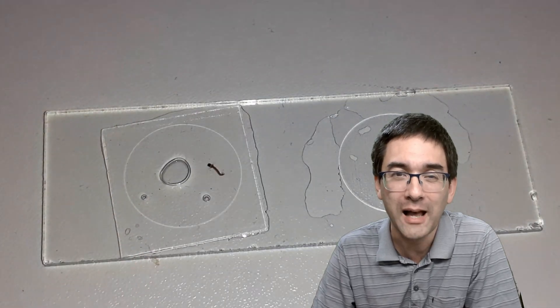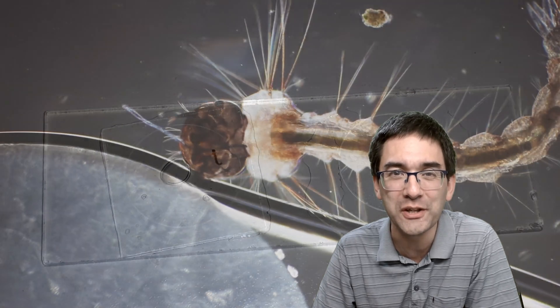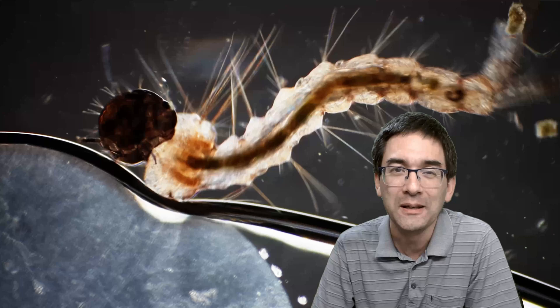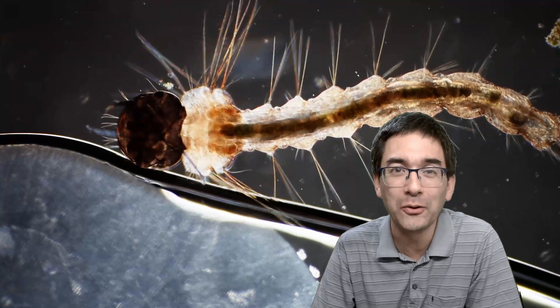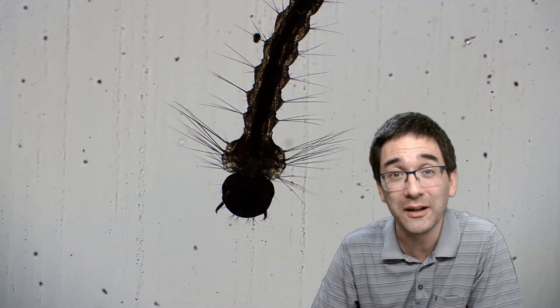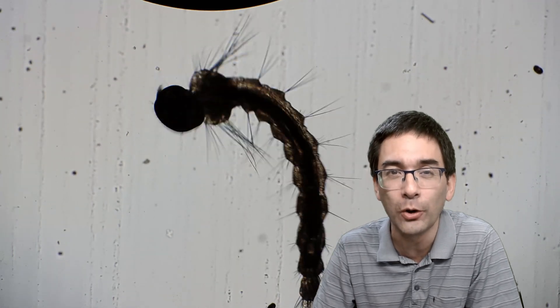There's also of course a small air bubble. Actually an advantage because those air bubbles restrict the movement of the larvae a little bit. Those mosquito larvae are also referred to as wigglers because they like to wiggle around a lot. Indeed they are a little bit difficult to observe under the microscope because they move so quickly and they are fairly large.